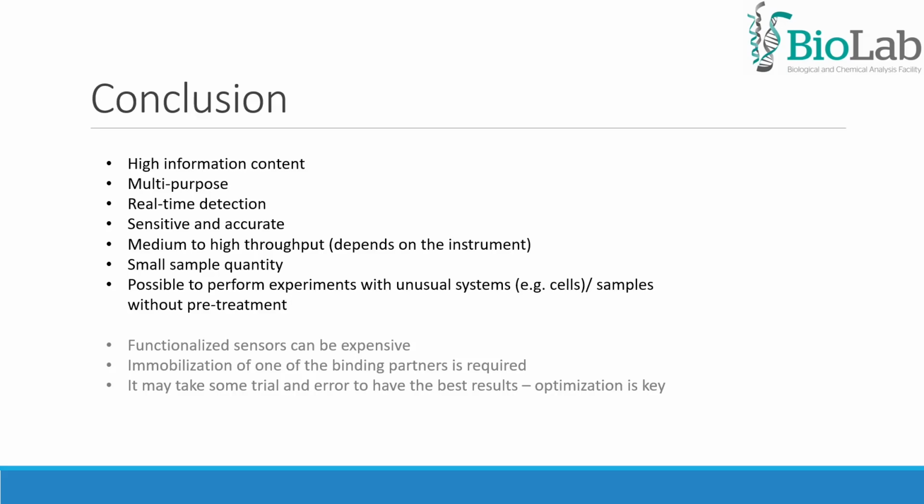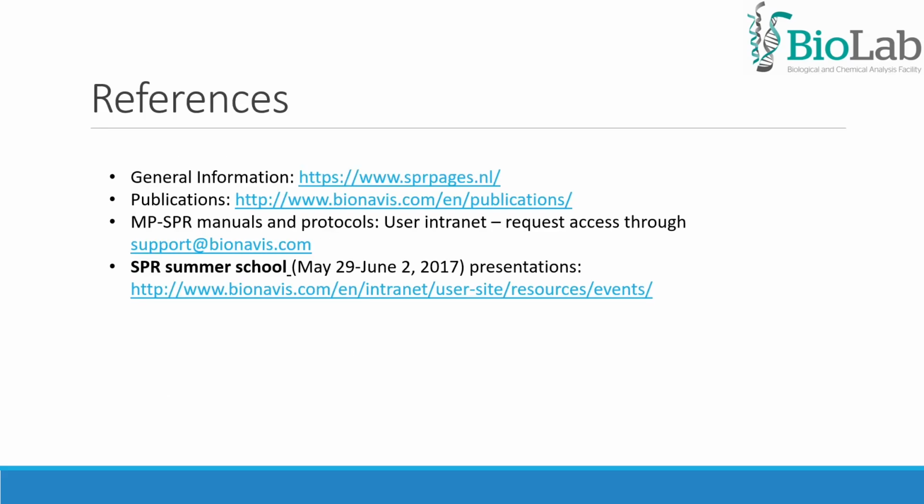On the downside, functionalized sensors can be expensive, it requires immobilization of one of the binding partners, and it may take some trial and error to get the best results. Optimization is key. To finish this webinar, I would like to recommend these resources for further information on MP-SPR.